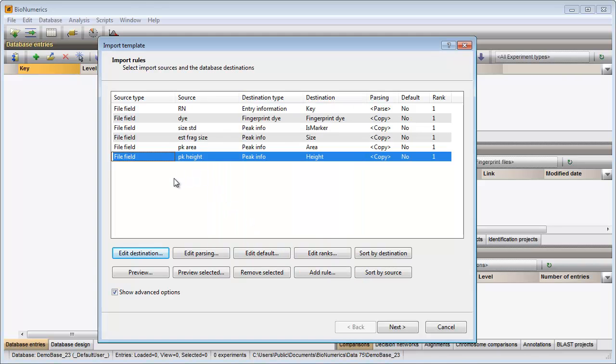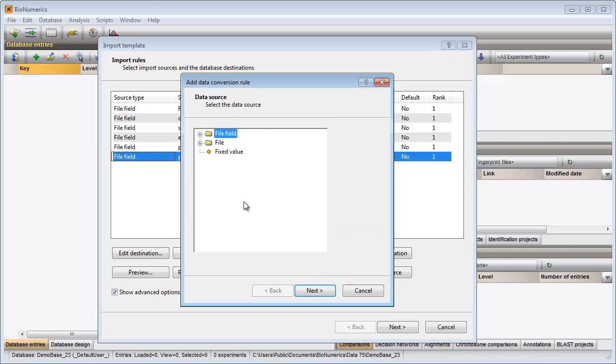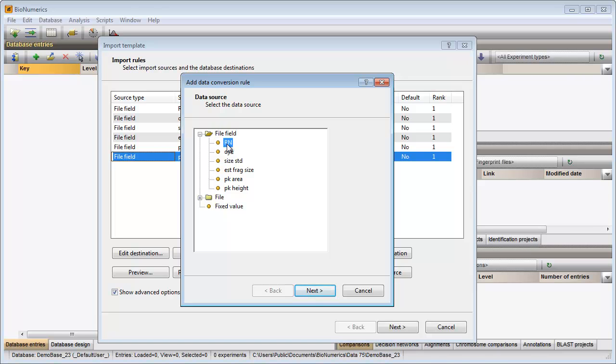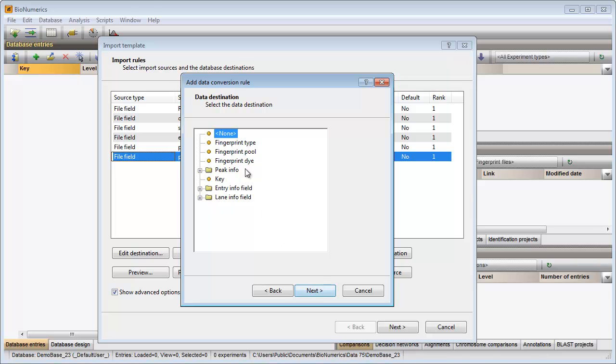Because the first column in my peak file does not only contain information about the samples, but also about the pools, I will add a new rule to the template. I press the add rule option. I choose the first column in my peak file as source, and the pool information as destination.